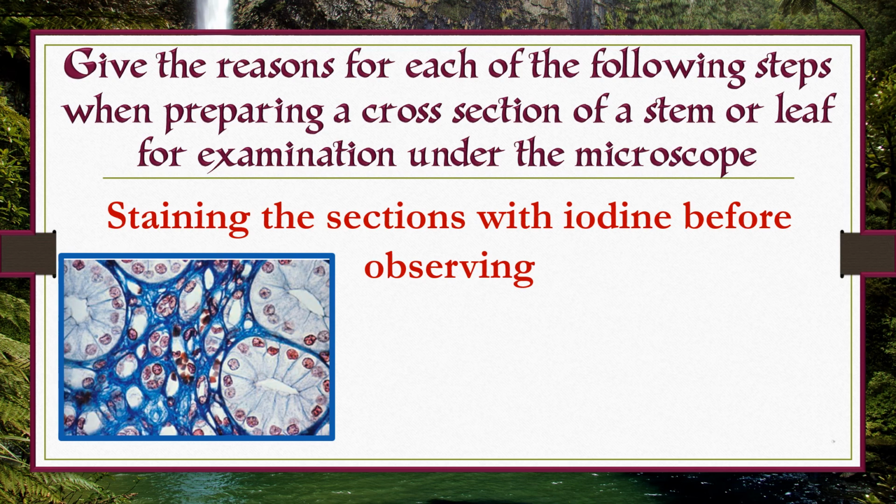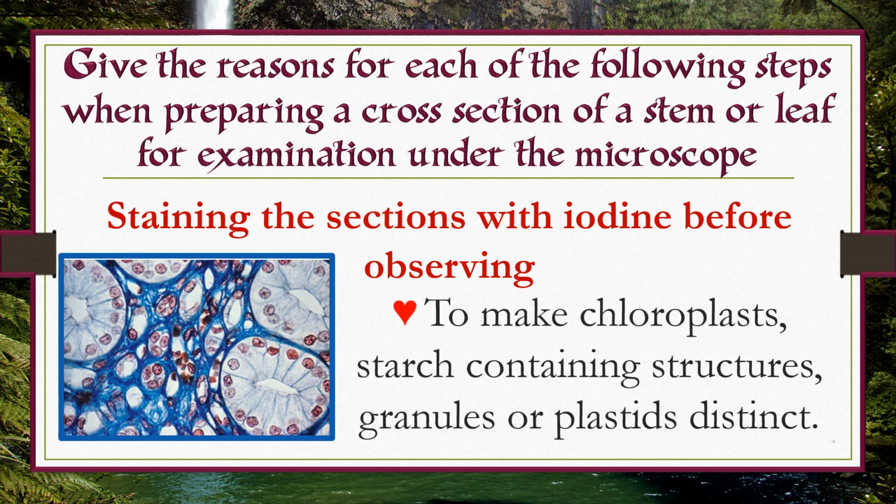Staining the sections with iodine before observing. The purpose of staining the section with iodine before observing is to make chloroplasts, starch-containing structures, granules or plastids distinct.